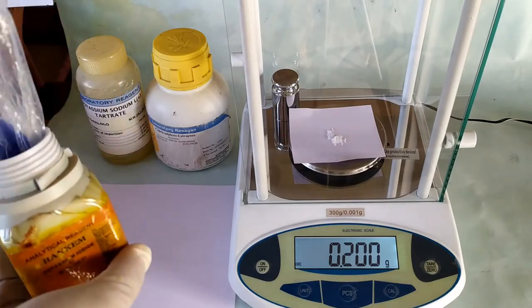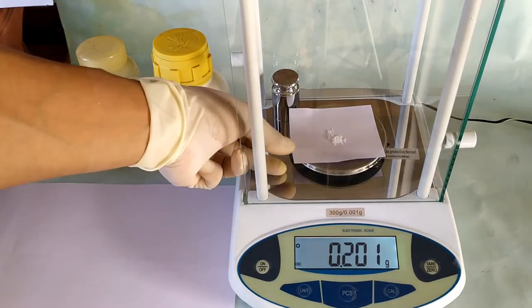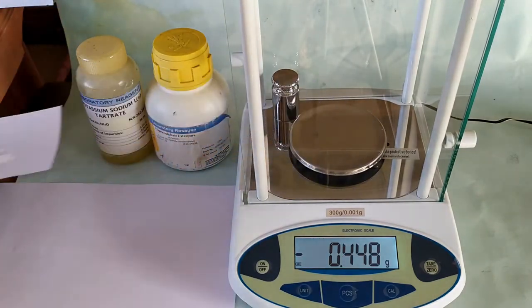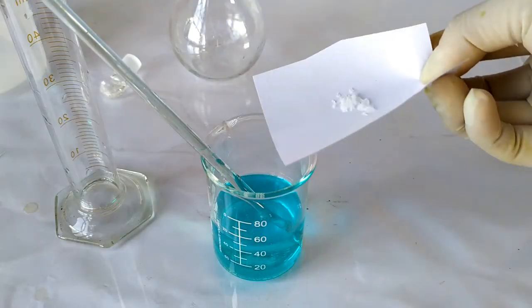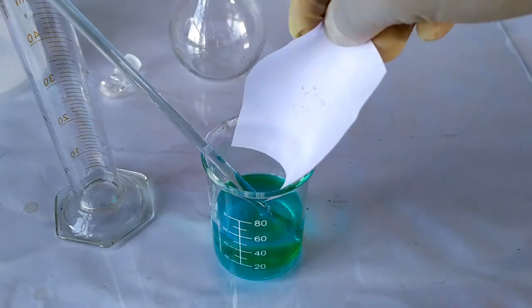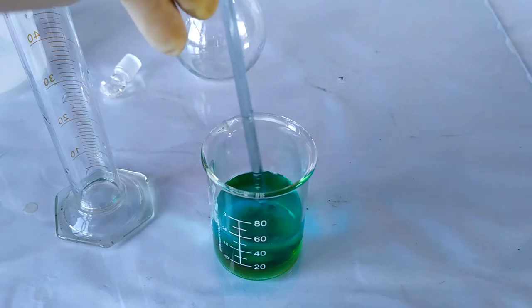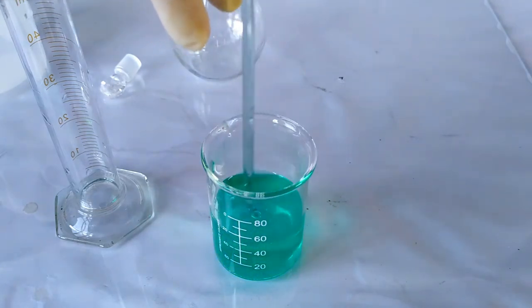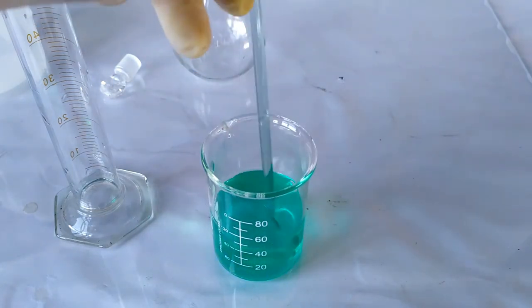Also weigh 0.2 g of potassium iodide and add it to the solution in the beaker. Stir to dissolve the iodide. Potassium iodide prevents the reduction of copper during storage of the reagent.